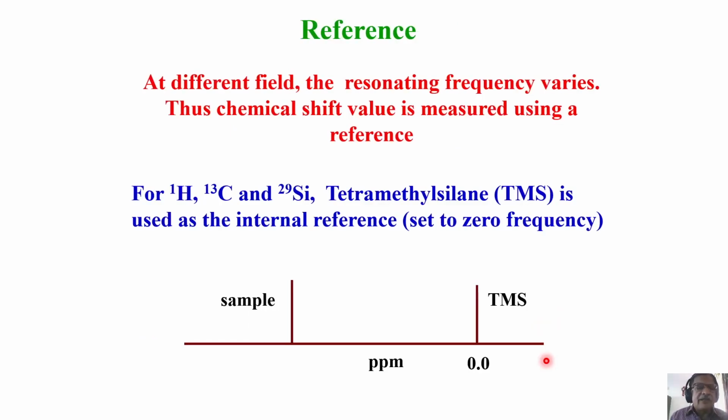Next, we'll talk more about the references, how you measure the chemical shift, what the unit of measurement of chemical shift is, and what happens to the chemical shift for different groups, everything. We'll discuss later. But for the day, I'm going to stop it. I hope you are all with me. I gave you some idea about the chemical shift, especially symmetry operation, counting of the protons with the peak positions, peak height, everything. This is a very interesting topic. You should know more about chemical shift because this is the basis for your analysis of NMR spectra. Okay, we'll come back later. I'll stop it here.